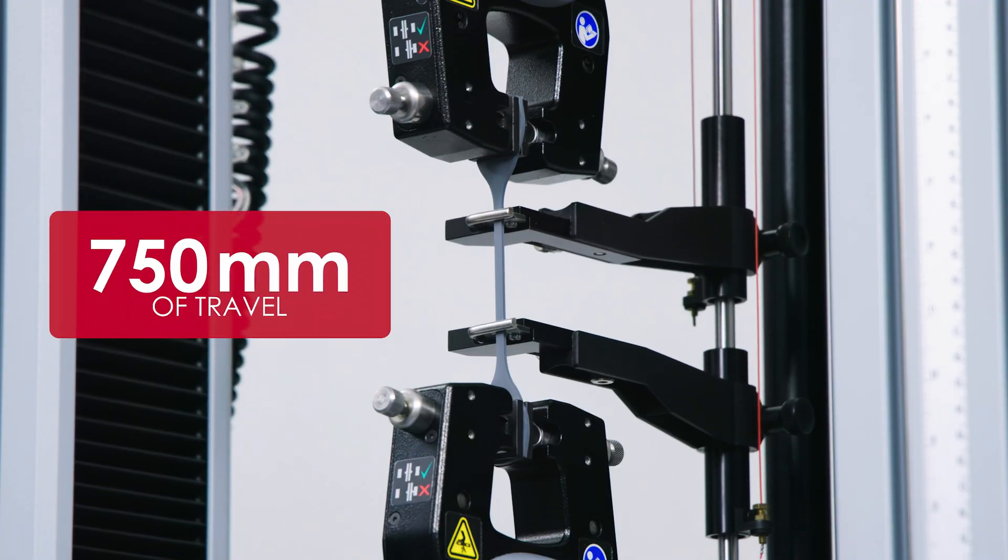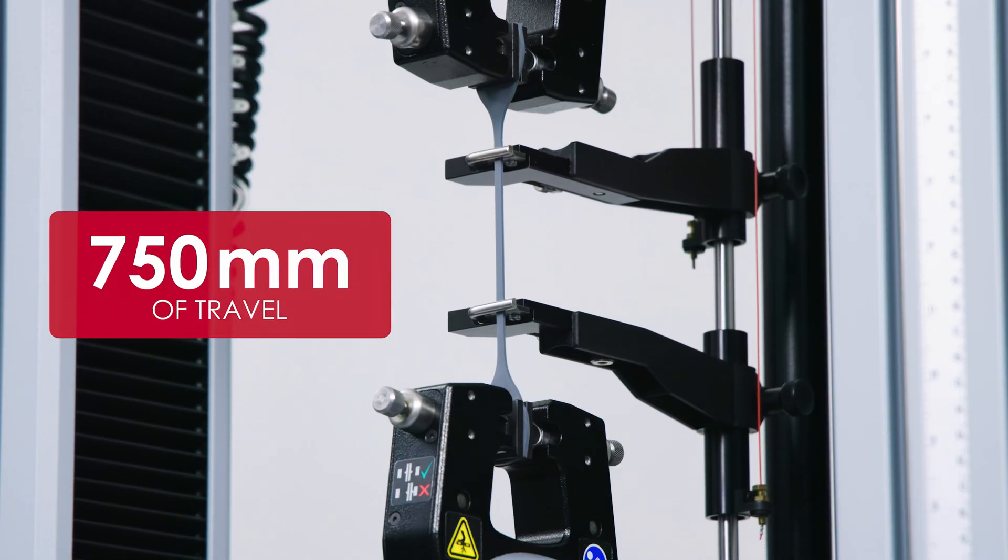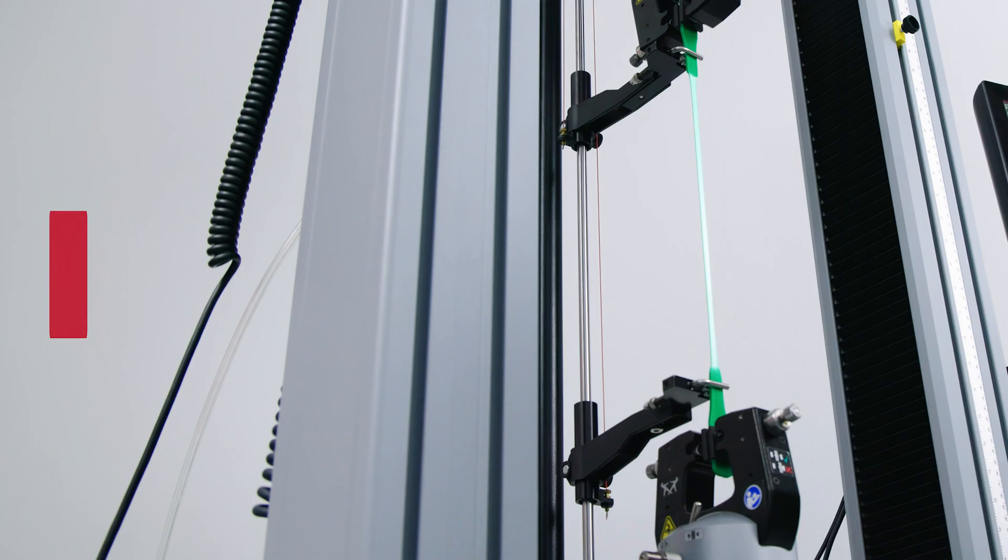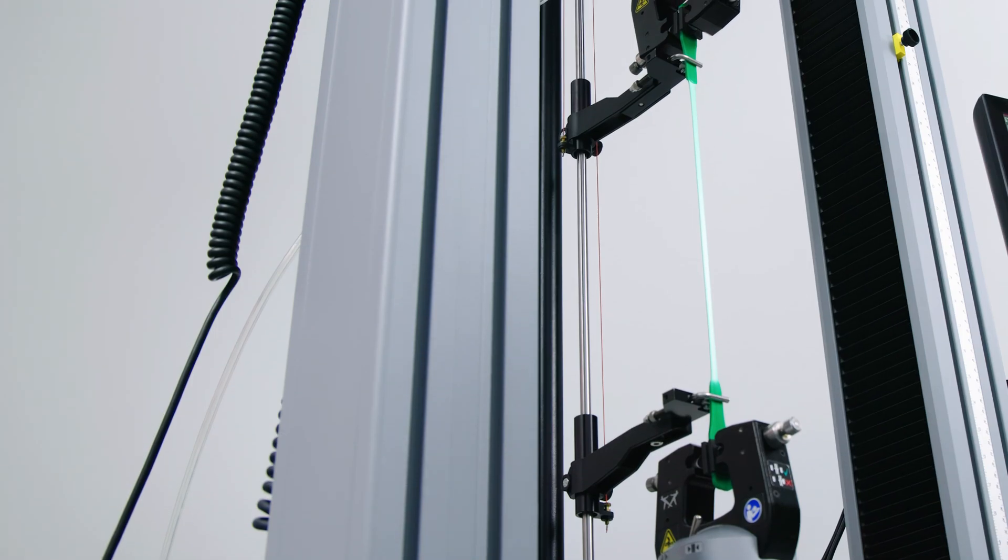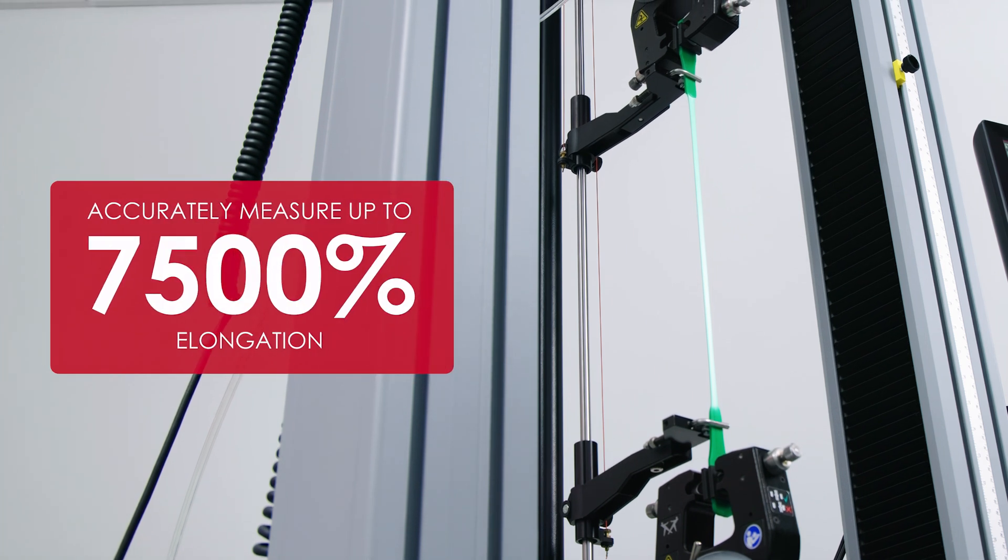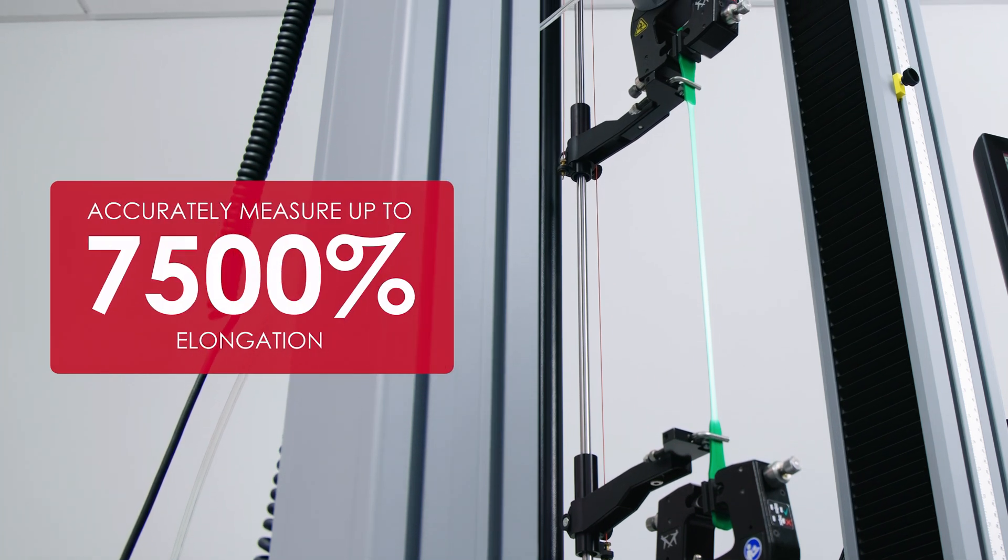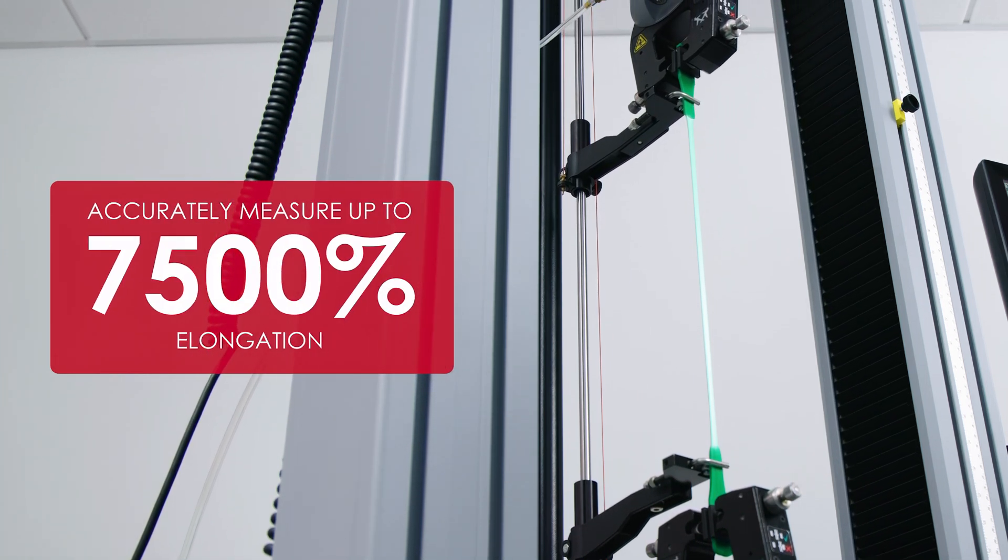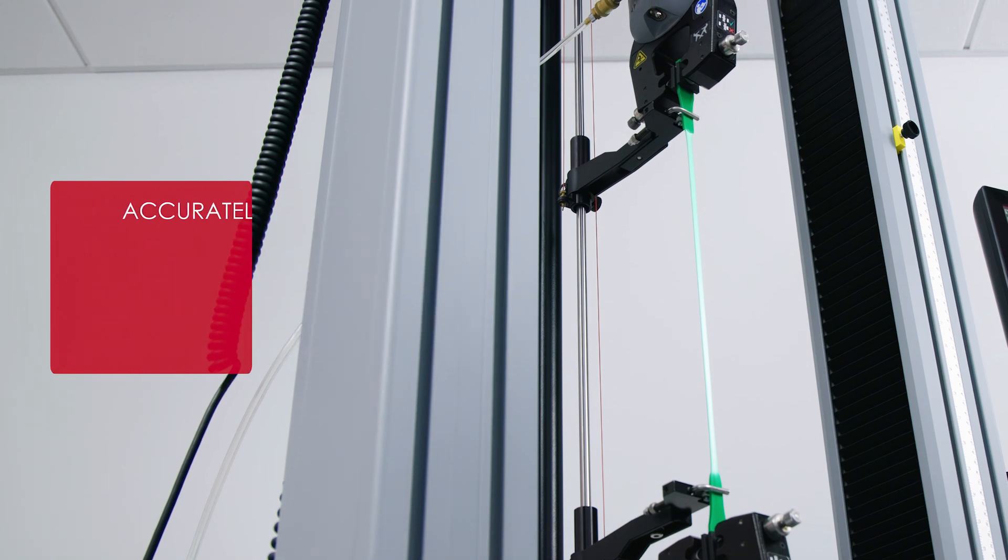Offering up to 750 millimeters of travel, the Long Travel Extensometer can accurately measure up to 7500 percent elongation before activating the mechanical limit protection.